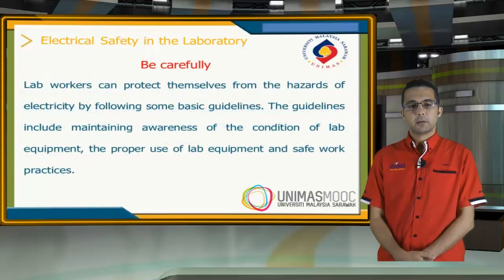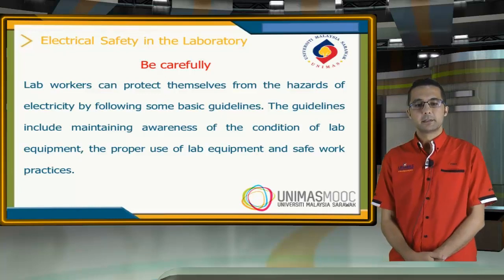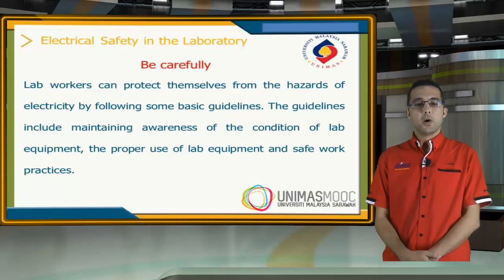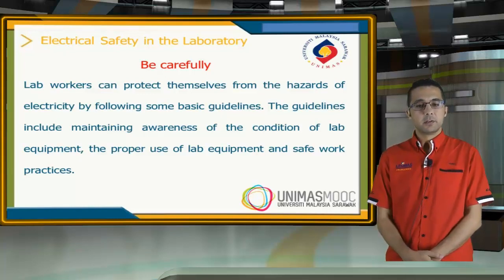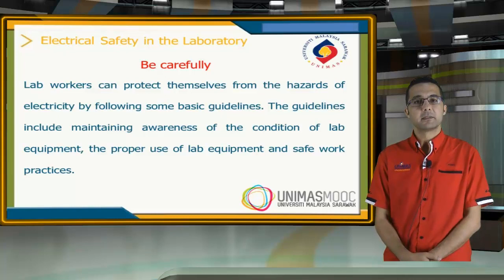Be careful. Lab workers can protect themselves from the hazards of electricity by following some basic guidelines. These guidelines include maintaining awareness of the condition of the lab equipment, the proper use of the lab equipment, and safe work practices.